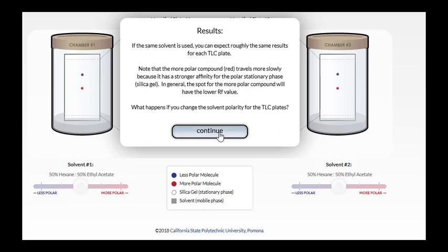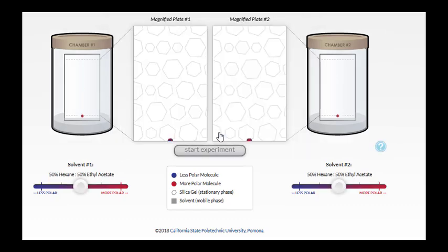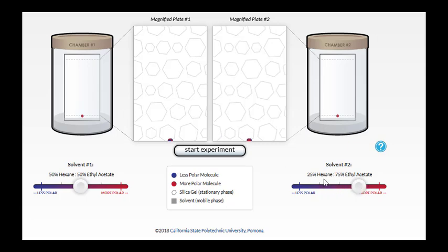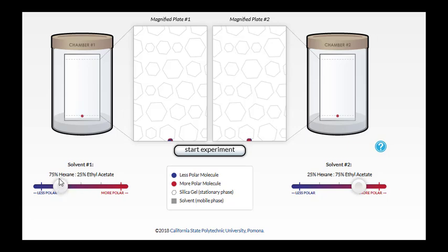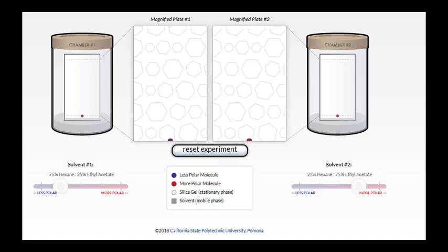Let's see if we can change the solvent composition and see how it affects the RF. We're going to make chamber number two more polar by adding more ethyl acetate. It's now at 75% ethyl acetate, that's a more polar solvent. And in chamber one, we're going to make the solvent less polar by adding more hexane. So over here, we have a 75% hexane, 25% ethyl acetate mixture.